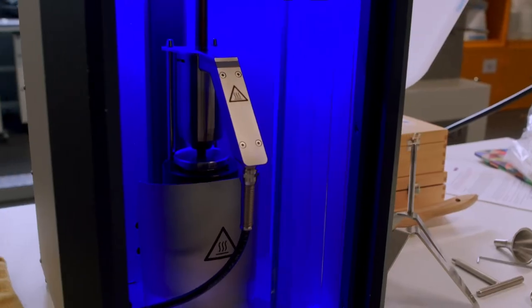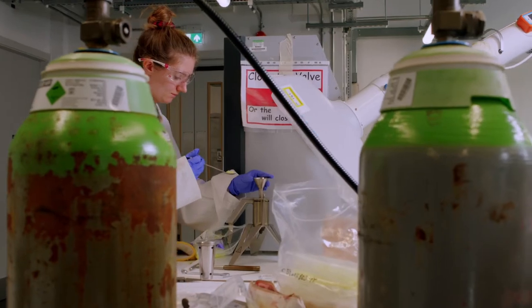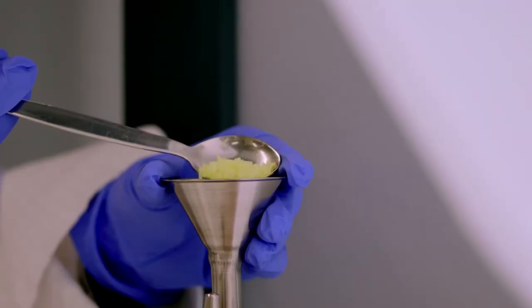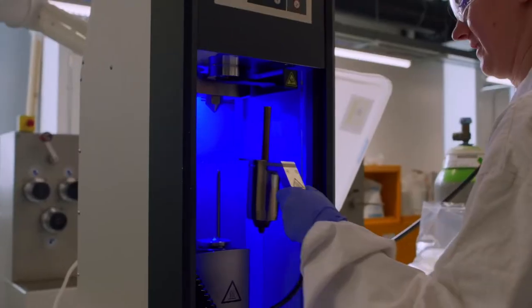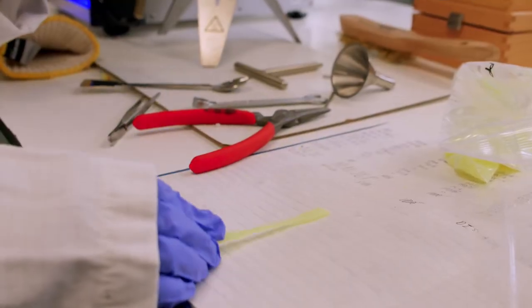We also have our compression molder here. Essentially what we do with that is we can take plastics either output from the extruders or brand new plastic pellets, melt them down and form them into different shapes. And then we can use those for subsequent testing to check out things like mechanical properties, thermal properties as well.